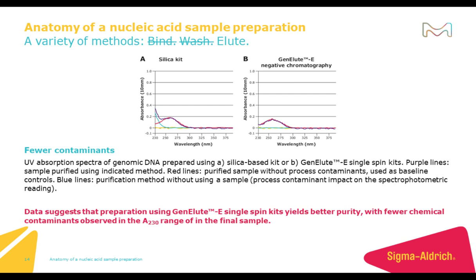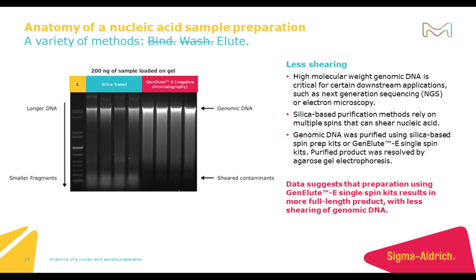Remember those pesky organic solvents and chaotropic salts from previous nucleic acid workflows? Shown here is an example of spectrophotometric data comparing silica-based protocols and the GenLuE Single Spin workflow. In purple is the sample purified by the different methods; in blue or teal is the purification without the sample added; in red is the sample without any process contaminants; and in yellow is the background blank for this analysis. As you can see, process contaminants can be observed from the silica method in the OD230 range.